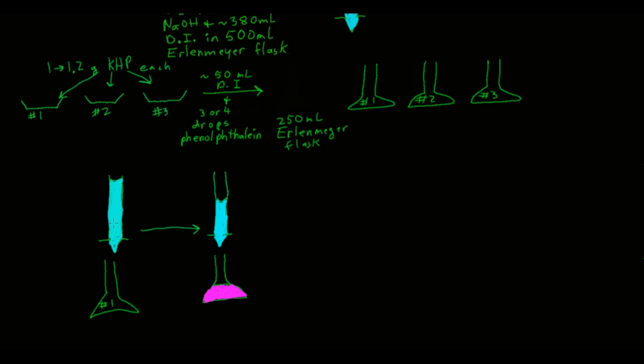Take your 50 milliliter burette with the sodium hydroxide stock solution and carefully add it to the Erlenmeyer flask containing the KHP, DI water, and phenolphthalein. As you add the sodium hydroxide base to the KHP — which is a monoprotic acid — everything will first be clear. As you get close to the end point, where you've added nearly as many moles of sodium hydroxide as moles of KHP, you'll start to see flashes of pink that disappear when you swirl the flask.